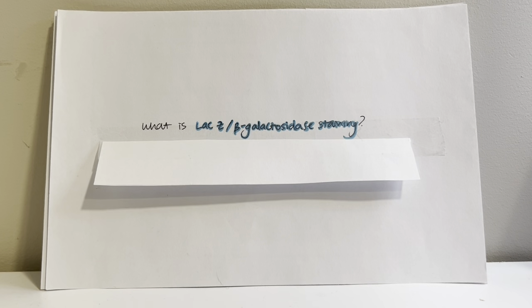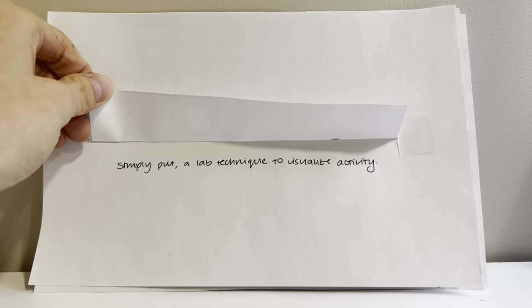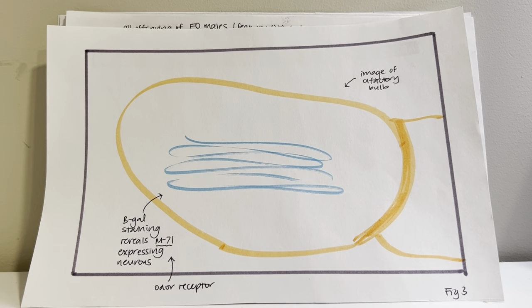So what exactly is Lac Z beta-galactosidase staining? Simply put, it's a lab technique to visualize activity, much like how I'm showing you this definition. A great way to see the efficacy of this technique is by looking at an example.